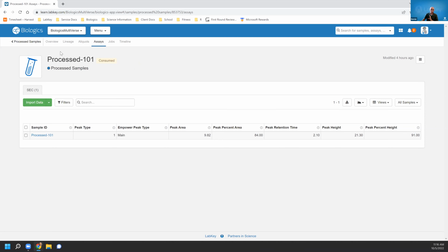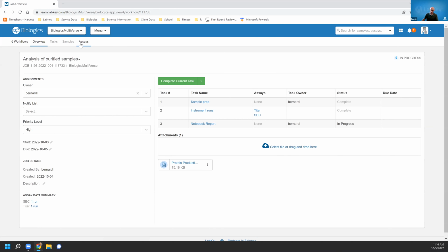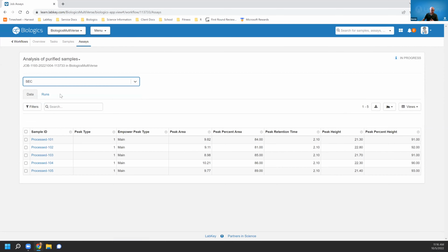What I wanted to point out though about this particular job that I showed you and the way that we are aggregating these different assays is that this is precisely how we accelerate the aggregation of data for reporting. View this data and walk through its specifics.